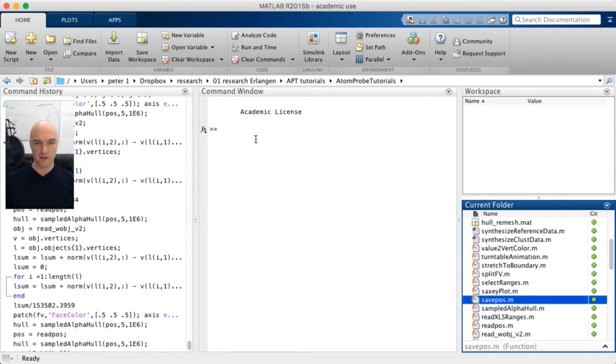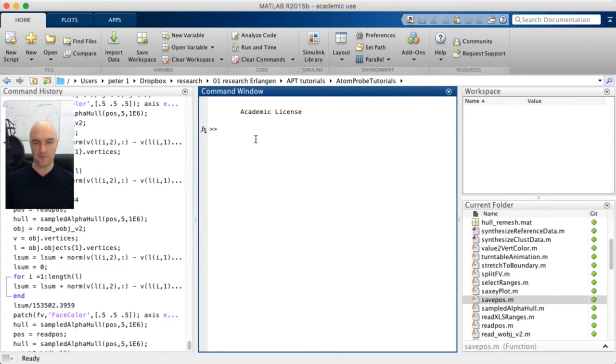And the 2 components that we need, firstly, to interpret our AtomProbe data are so-called POS files and range files. So you probably, if you're watching this, already have at least some experience with AtomProbe tomography. So you'll know that you identify certain ionic species, usually by going into the mass to charge state histogram and saying, okay, from mass to charge state this to mass to charge state this is this and this ion. Of course, this produces some issues with overlaps and so on and so forth, but that's the way we do it right now.